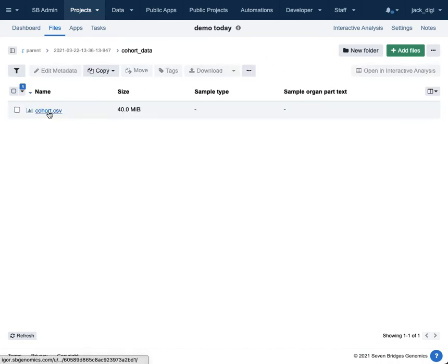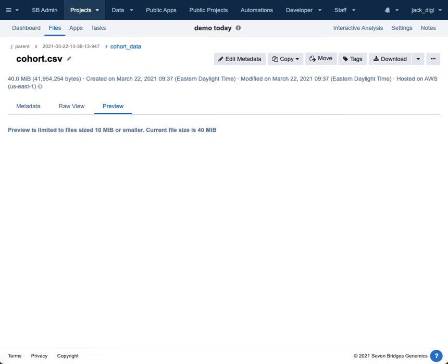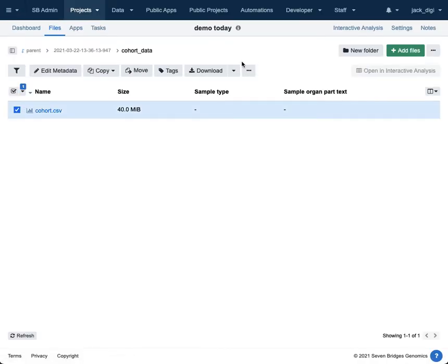You could take this and download it to analyze it locally. Also, we could think of other ways to work with that data on the platform.